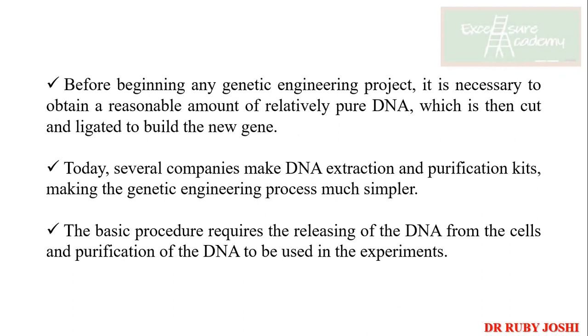No, I'm talking about purification. Isolation means you will have other contamination also along with the DNA. So I was talking about purification. Anyways, I'm sure you are aware of the steps involved.